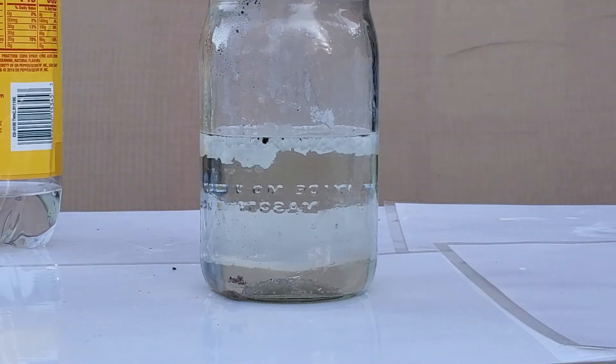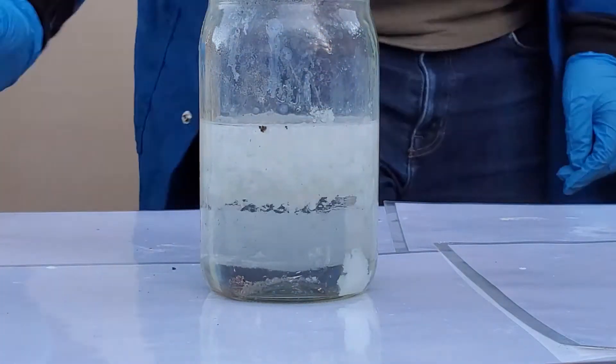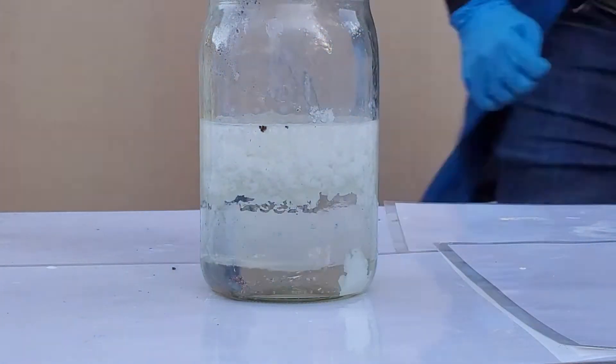I continued adding the ammonium hydroxide slowly. Eventually you can see a white precipitate forming that sort of looks like cottage cheese — and that is our bismuth hydroxide.